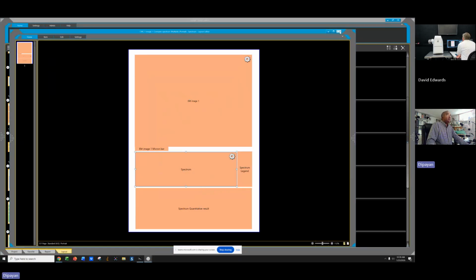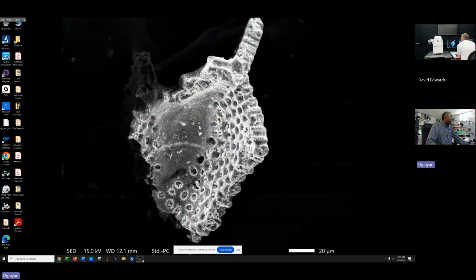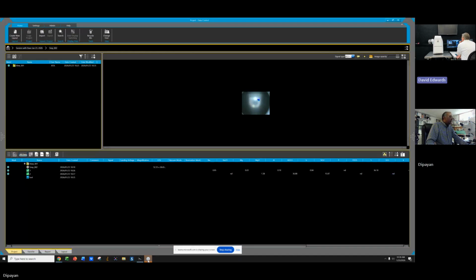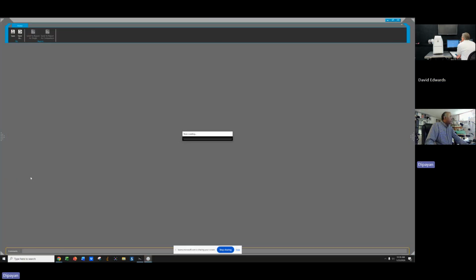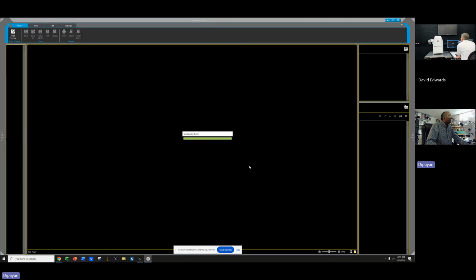Okay, let's get the actual. Let's close that. Where is my data management that has your spectrum? There it is. Okay, so send the report. Okay, so this is not what you want me to say. I'll go straight to PowerPoint.